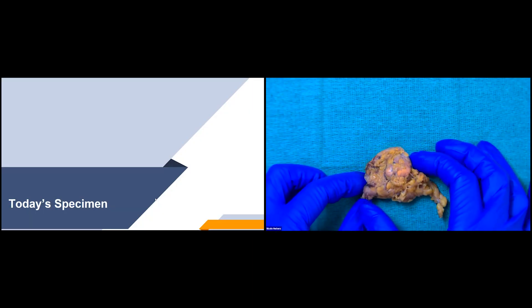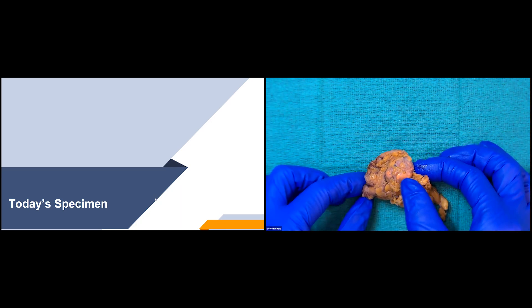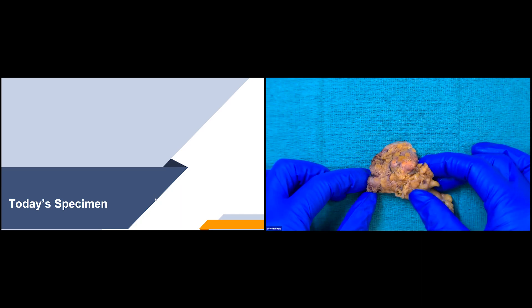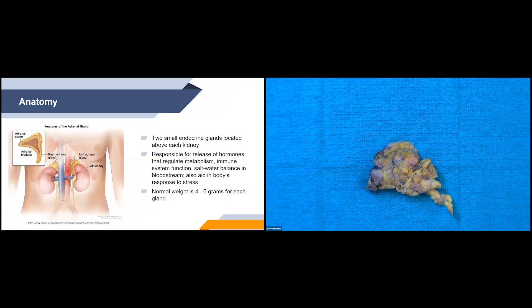So we have our adrenal gland here. You can see it with that yellowy appearance. And all of this fat attached to it is the periadrenal soft tissue. The adrenal glands are two small endocrine glands located above each kidney. They are responsible for the release of hormones that regulate metabolism, immune system function, salt-water balance in the bloodstream, and aid in the body's response to stress. The normal weight per gland is about four to six grams.